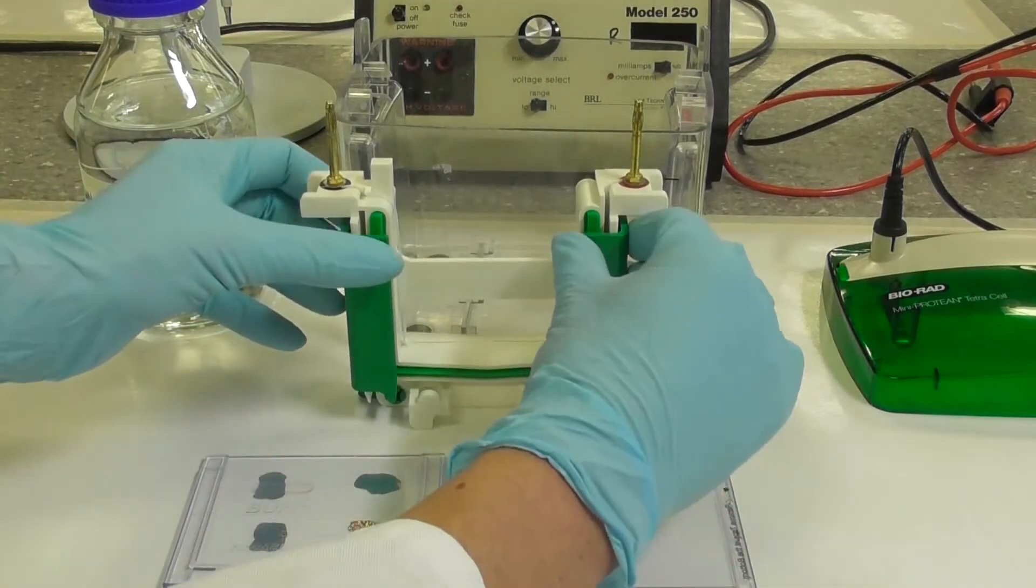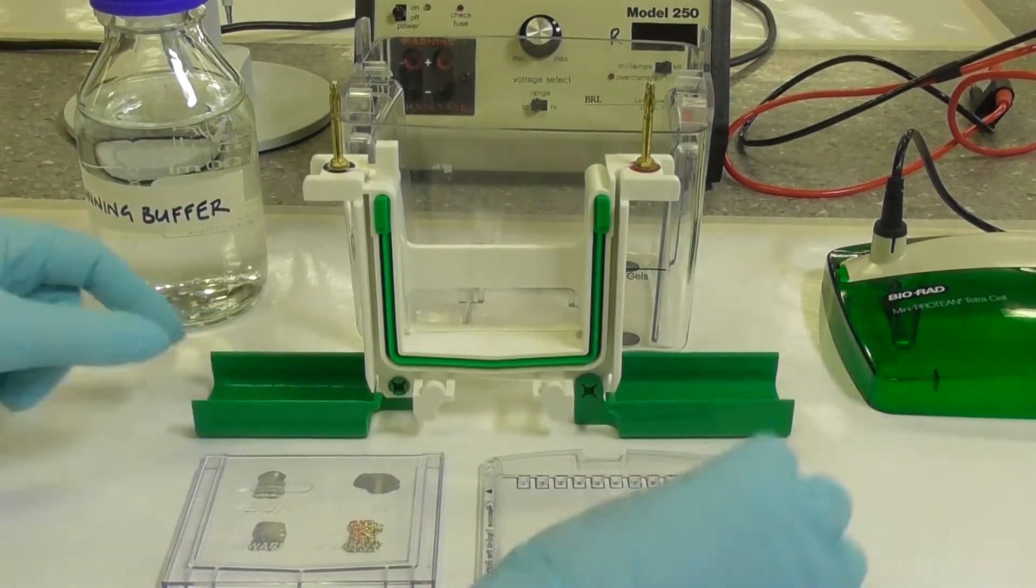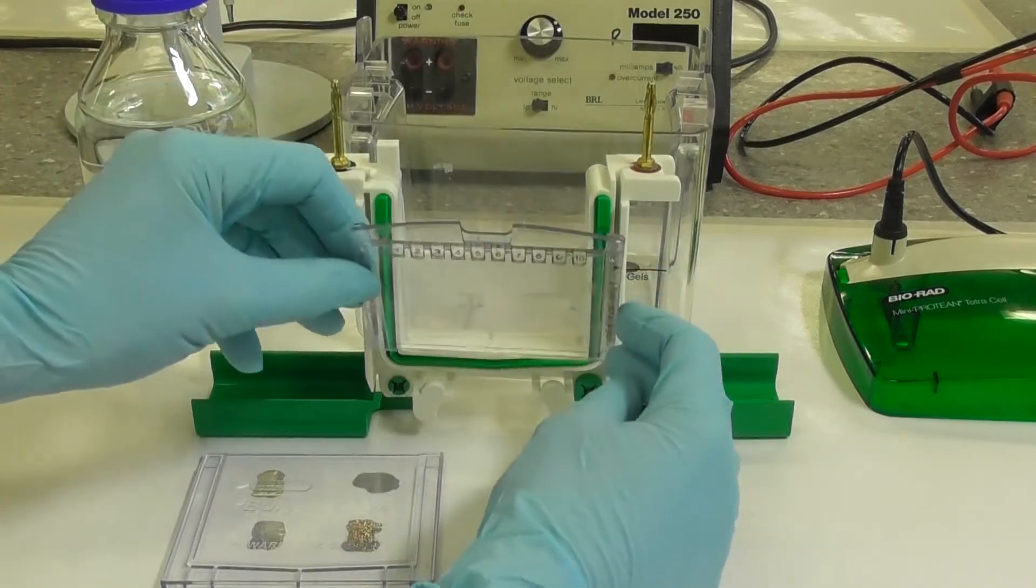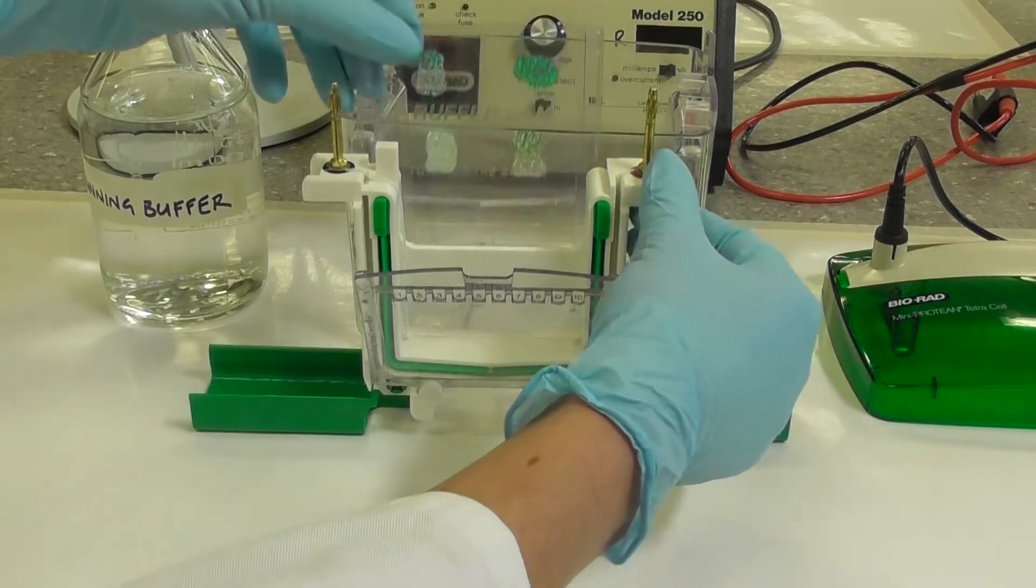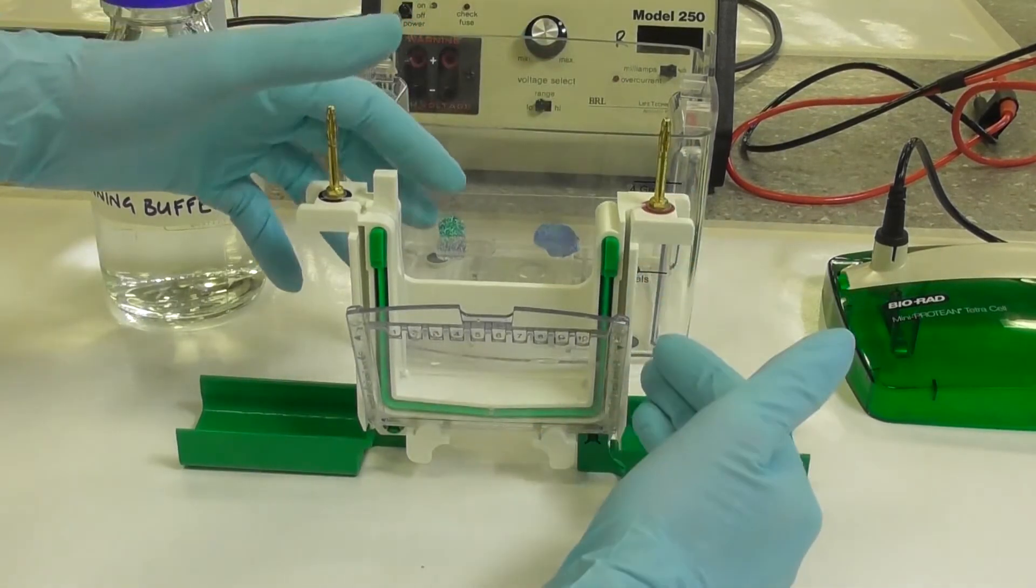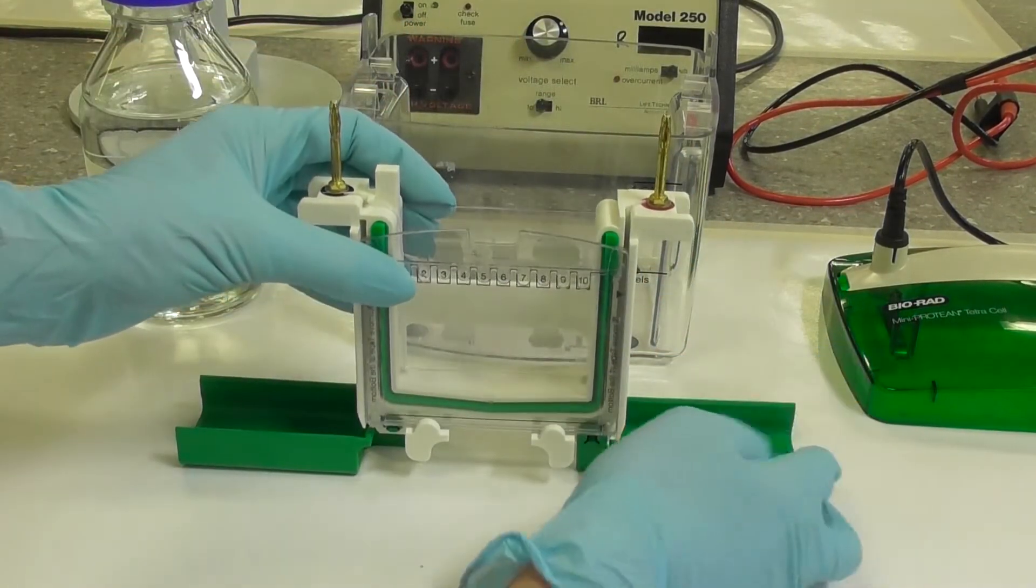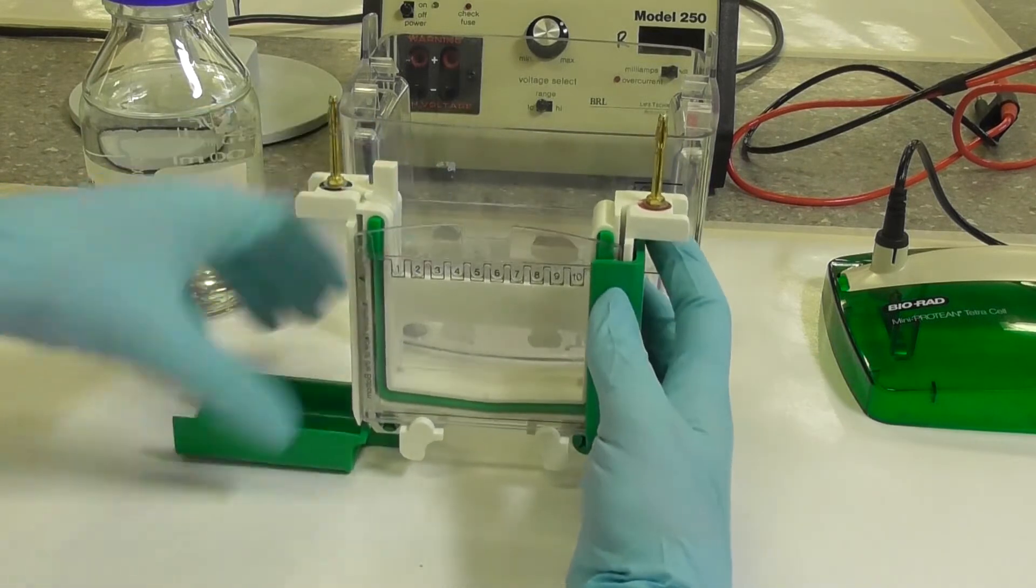Fold down the two arms of the unit. Place the gel with the shorter plastic plate inwards on the plate rests. Place the buffer dam on the other side so that it seals against the contours of the green gasket. Press the gel and dam towards the centre and fold up the two arms of the unit.